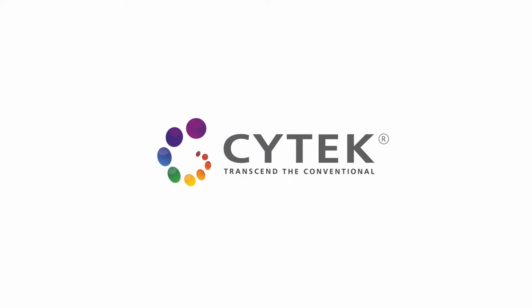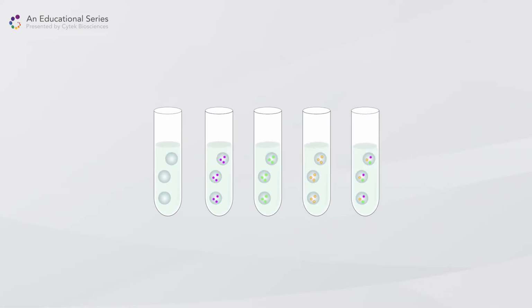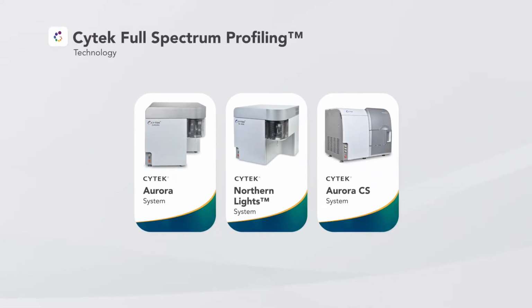Welcome to Cytek Bioscience's video tutorial on best practices for controls. In this video, we will outline the requirements for creating good controls in flow cytometry and how those apply to Cytek's full-spectrum profiling systems using Aurora, Northern Lights, and Aurora CS instruments.